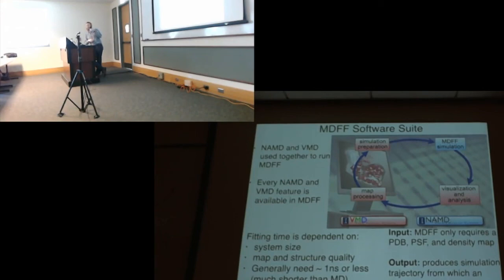Because MDFF is software in both NAMD and VMD, all the features in both those two programs are available to us. And so anything that you want to use in NAMD while you run your fitting simulation, you can use in principle with MDFF. Yeah. So you can use VMD or NAMD to take the MRC map from the cryo-EM and change it to the potentials? So you use VMD for that, yes. I forgot to mention the map processing, but VMD will actually convert the MRC file to a potential and do all that, yeah.